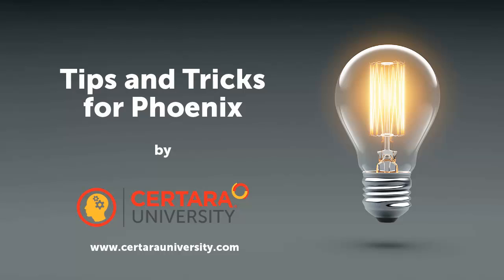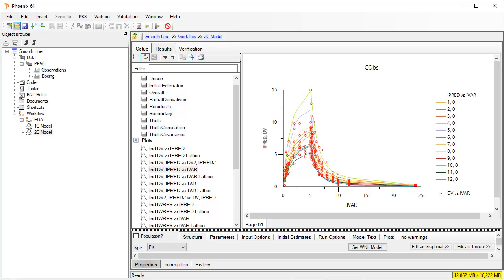This short video by Certara University will show you how to generate a prediction plot with a smooth line from Phoenix modeling output.